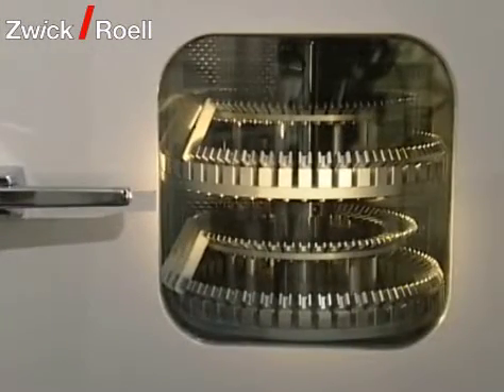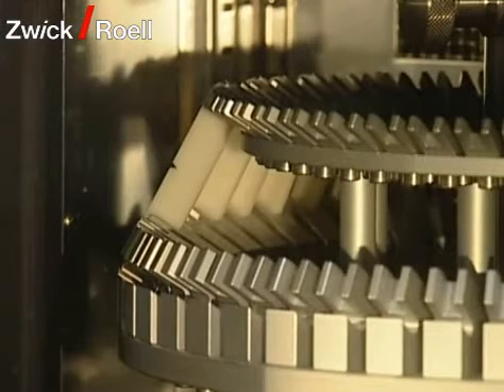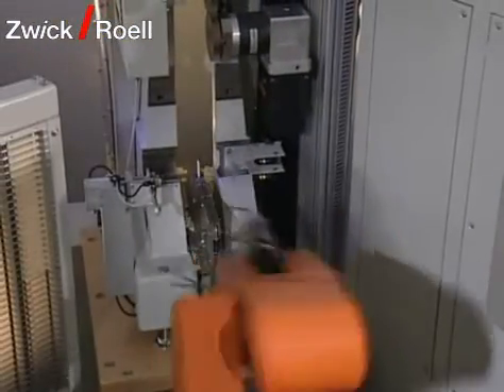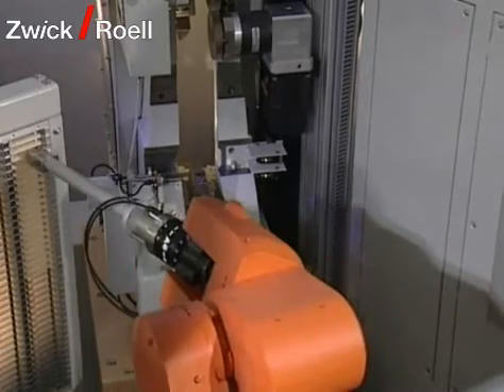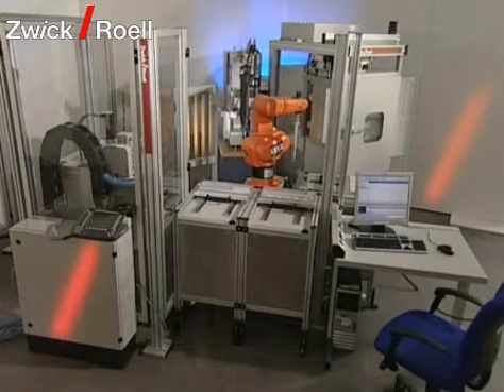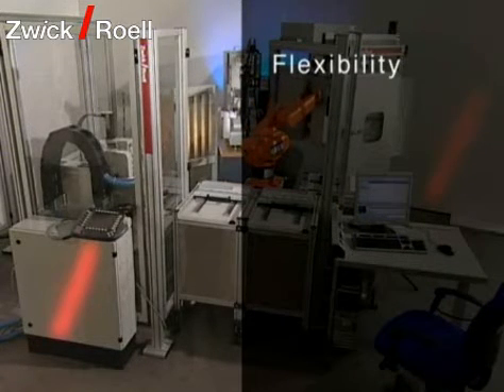Specimens can be cooled down to minus 60 degrees Celsius with the integrated temperature chamber. Because of the quick transportation of the specimens with the polar robot, the specimens are tested according to the standards within a maximum of five seconds after removing them from the chamber. Because of its modular structure, several pendulum impact testers can also be integrated in the testing machine or built in later on.